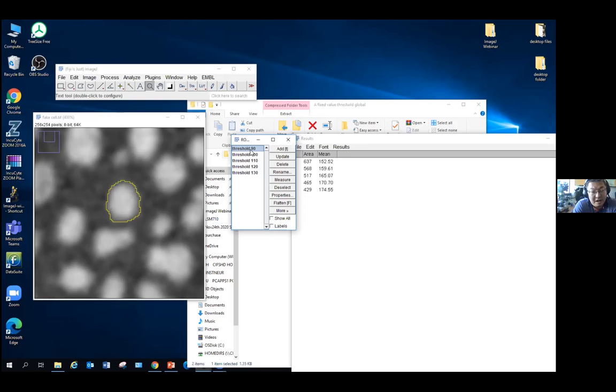And the same thing when looking at the sample image from the control group, which by my hypothesis is that the cells should be smaller. Then when I try to select the thresholding to identify the cell in the control group, I may be more likely to choose a thresholding of 120, 130, because I know it will make it smaller, and I believe that is what's happening.